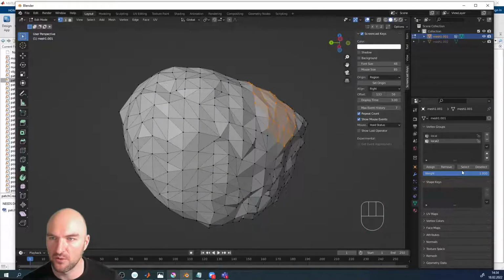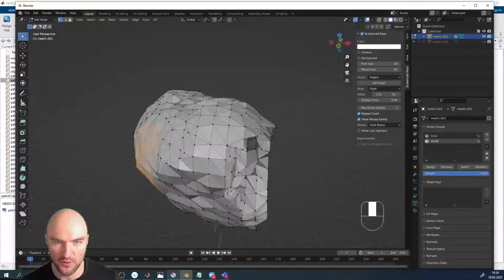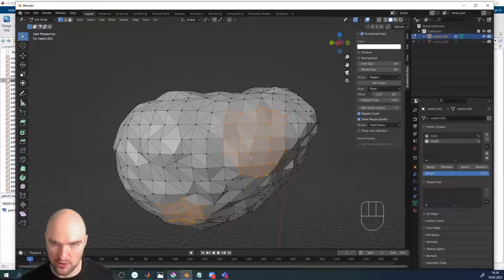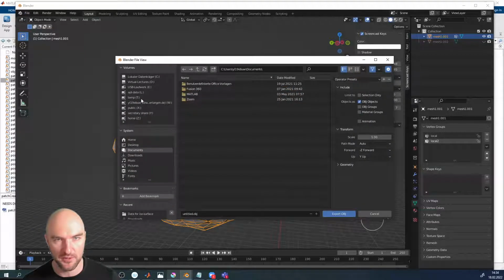And if I select local 2, it will show the local 2 ones. So we have two vertex groups defined on that object. Now we can export those vertex groups into an OBJ file that we can load into MATLAB. So we'll just go out of edit mode into object mode and go File, Export, Wavefront OBJ again.